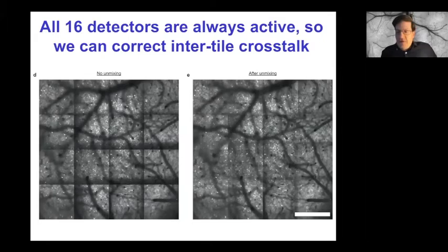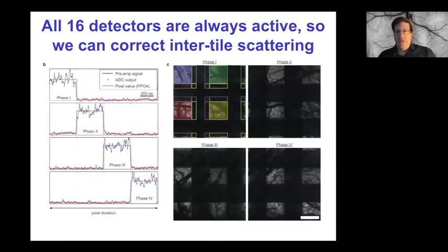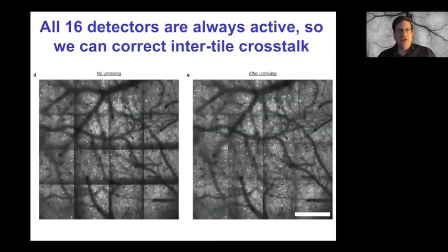So the simplest way to piece together the image would be merely to add the images that one attained in the 4 different phases. And if you do that, you get an image that looks like something here on the left. The scale bar shows you the size of one of these tiles, which is 500 microns. And perhaps you can see some of the seams between the tiles.